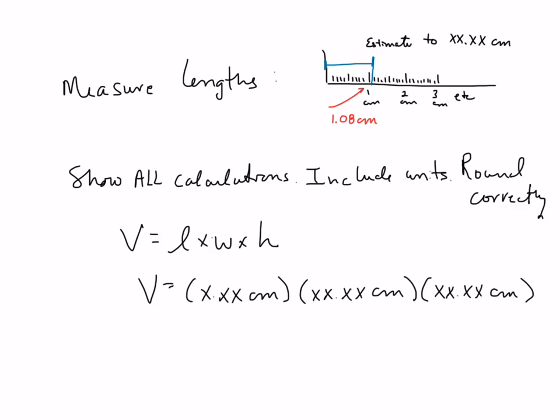The rulers are over here. I got plenty of rulers. Okay? So you're going to get each of the dimensions and you're going to multiply them together to get the volume. Here's just my reminder to show all of your work.